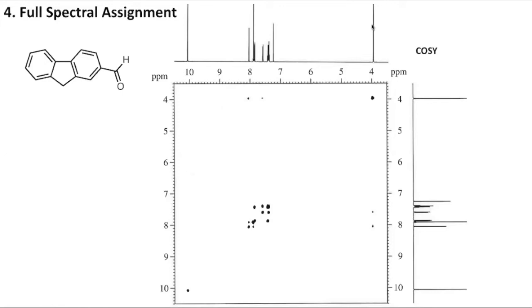Unfortunately, it's a little harder to see what's happening with these peaks here because we're zoomed further out. We'll do the best that we can as far as labeling, but we won't be able to see the splitting as well, and we'll have to be pretty careful in this region because a lot of these lines are pretty close together. We're going to have to do some fine detail work to make sure that we're seeing the correlations as carefully as possible. So here we go with our labels.